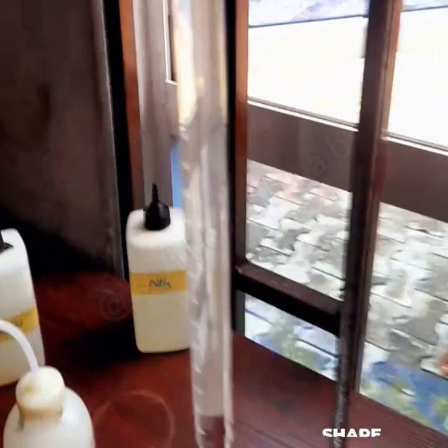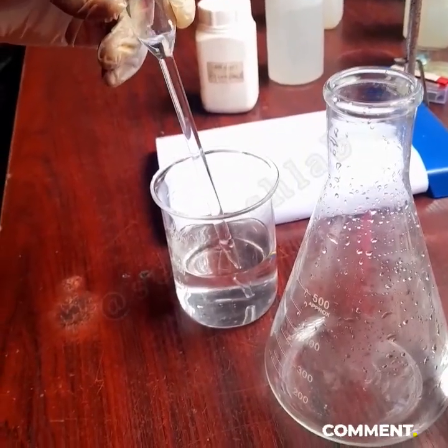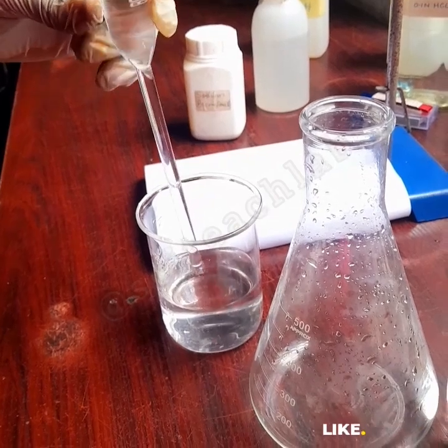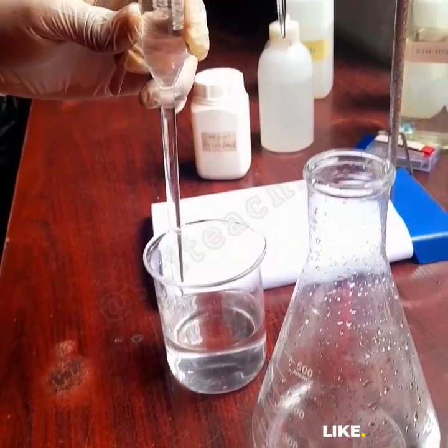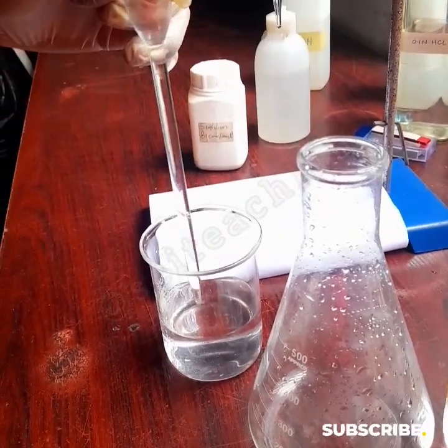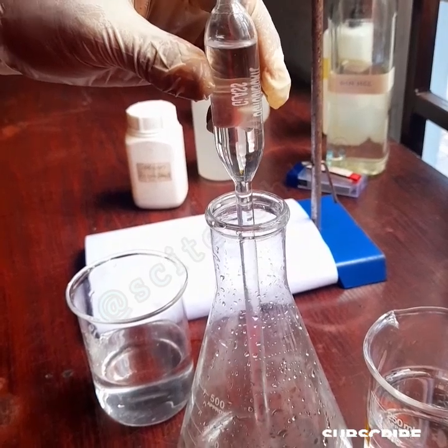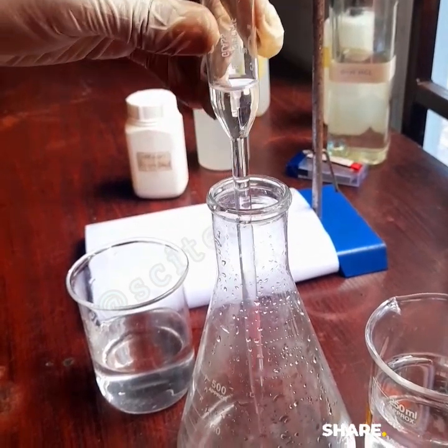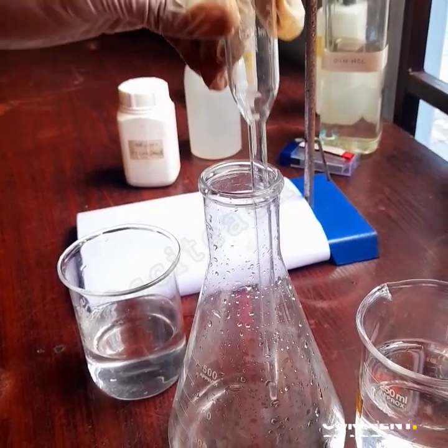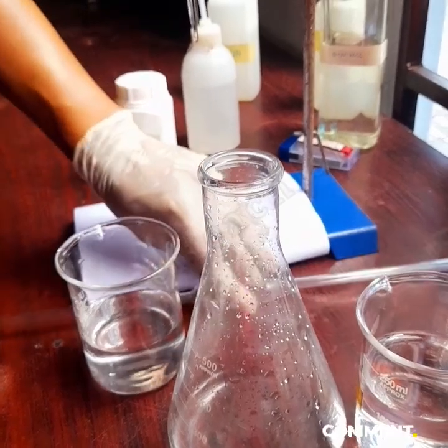Okay, now the next thing I will do is to pipette my 25 cm cube of B, okay, the E in the equation. Don't be confused. A is the acid, B is the base for me. So that's 25 cm cube of sodium bicarbonate measured and then turned into the conical flask. All right, so the conical flask is where you turn your base into.